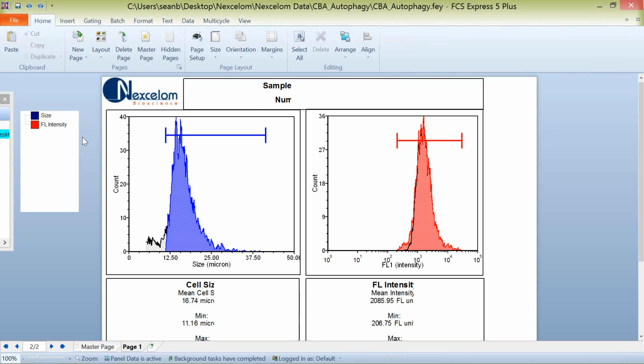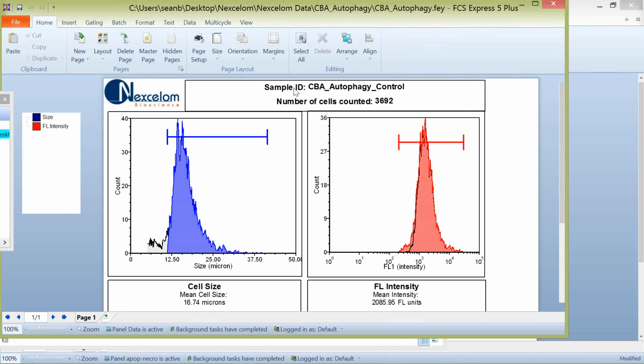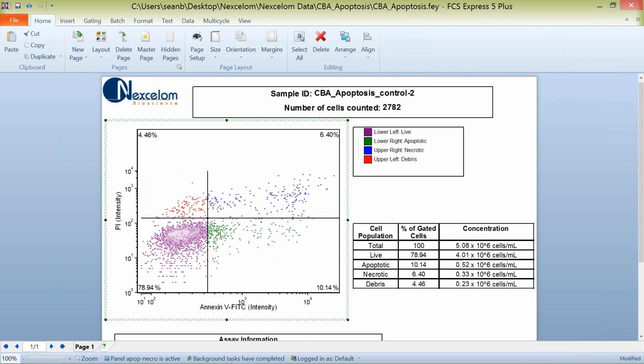Sean, can I ask one quick question? Absolutely. The 2% population data, is it possible to take off the enhancement feature, or is it automatically built into the software that any population under 2% will automatically get blocked?